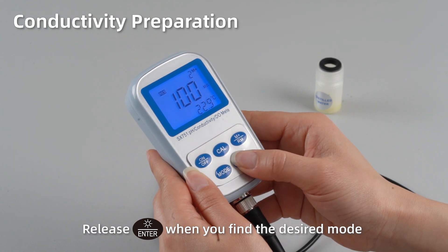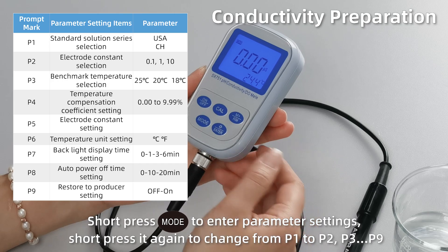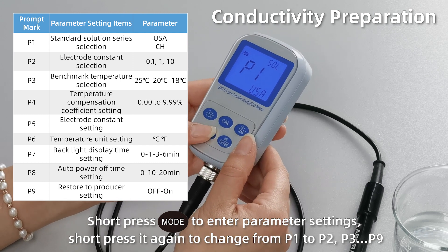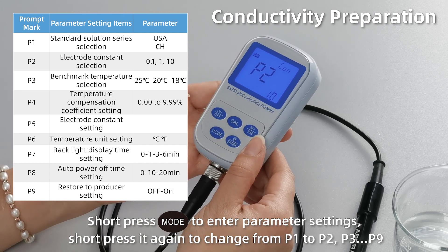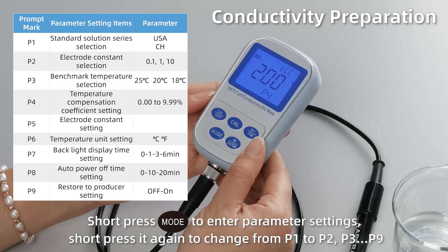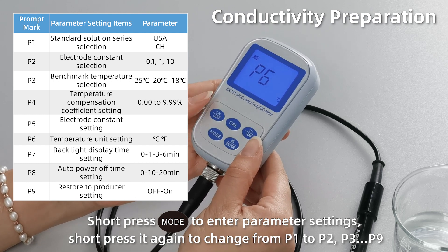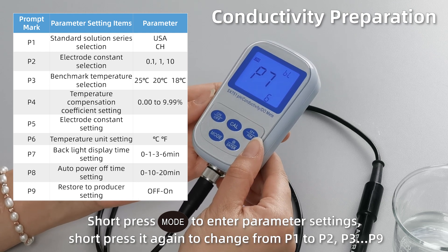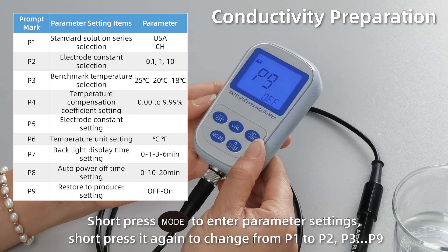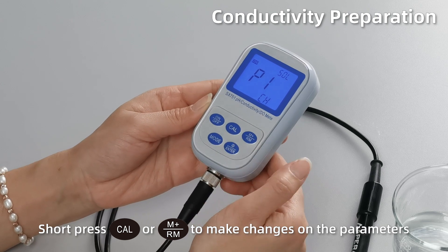Release Enter when you find the desired mode. Short press Mode to enter parameter settings from P1 to P2, P3, all the way to P9. Short press Enter to confirm the changes on the parameters.